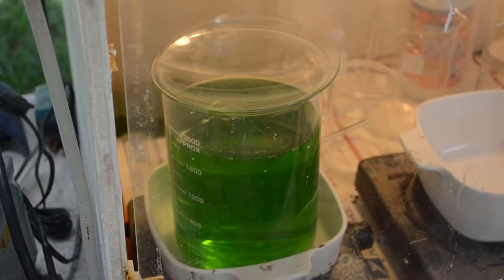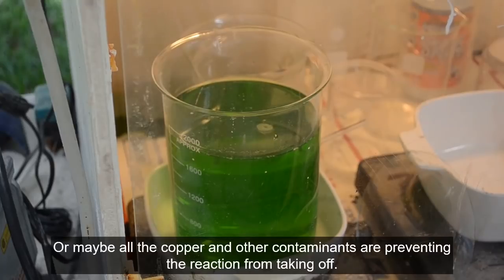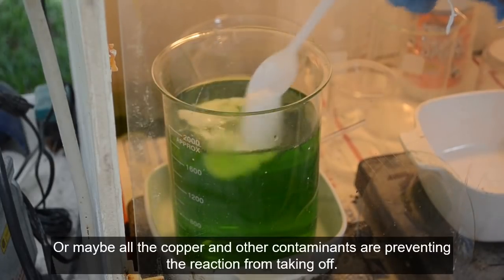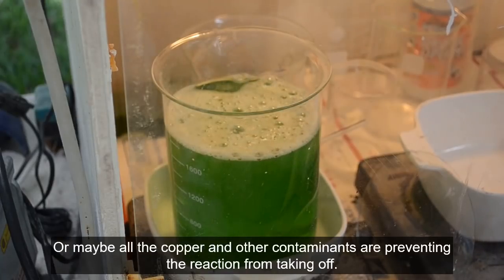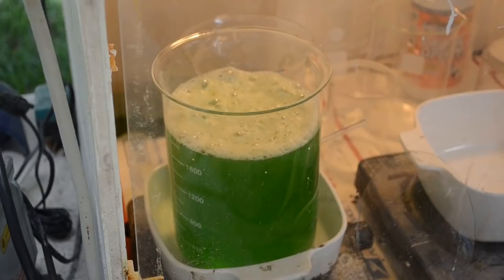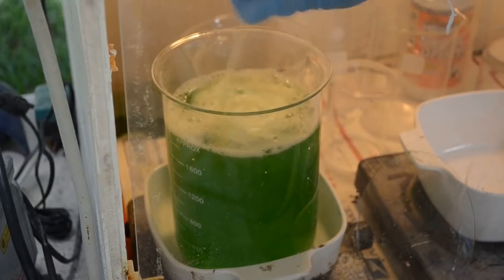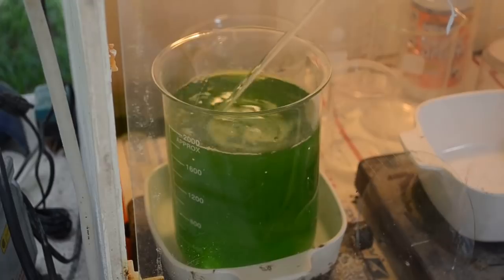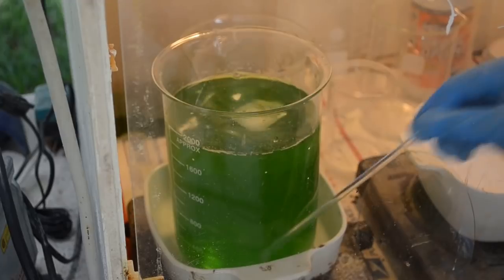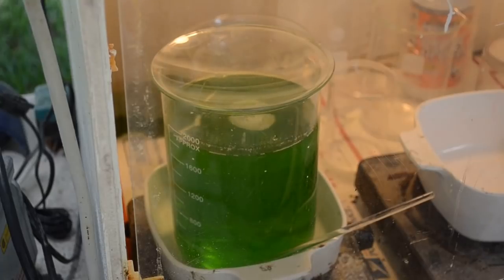Well, it's been a few minutes and nothing much is happening, so I'm going to add some more SMB to it. I thought I got it denoxed really well, but maybe not. We are making white foam, which is generally a good sign, but we're not getting any gold precipitation. Let's see what that does. Fair amount of SMB in there now. I'll just let that go for a while.